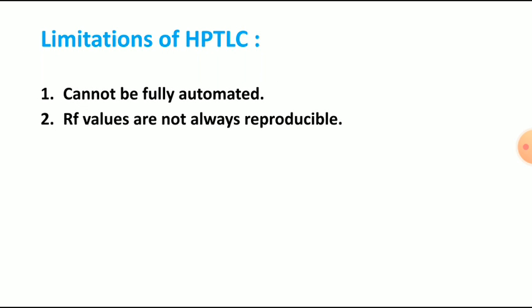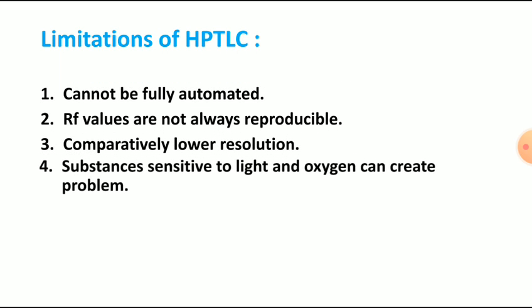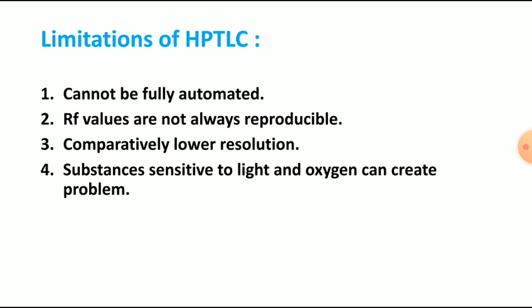RF values are not always reproducible, comparatively low resolution, and the last one is that substances sensitive to light and oxygen can create problems.